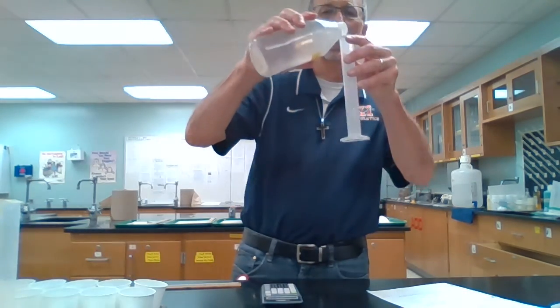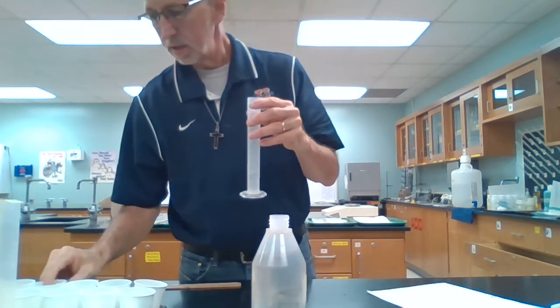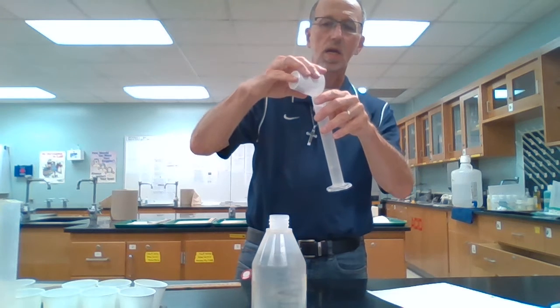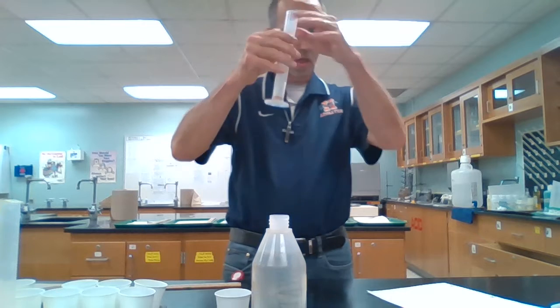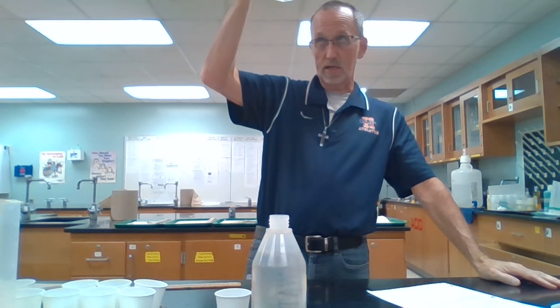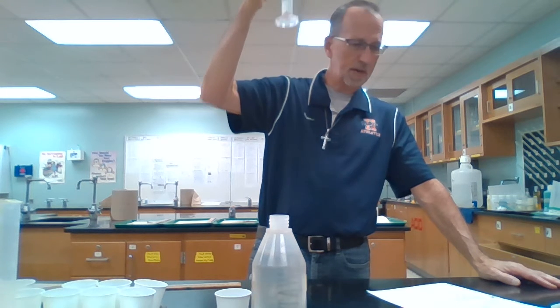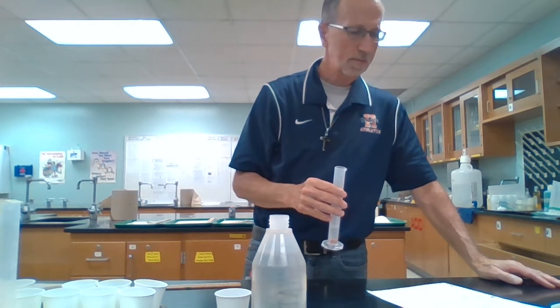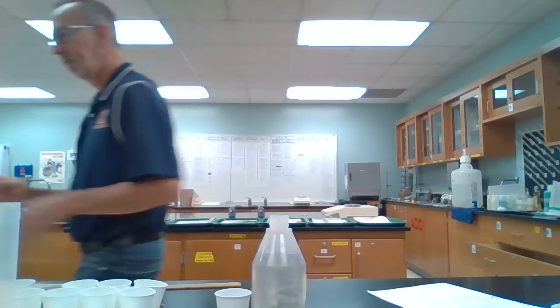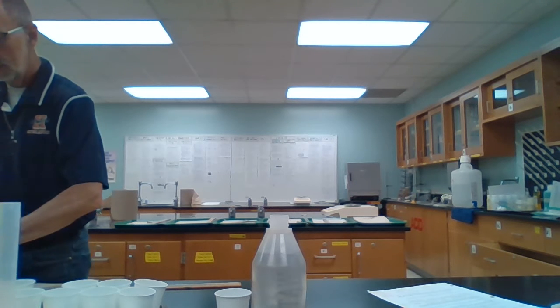Number 4 is little pieces again. So I need some. There we go. We'll put those in there. And let's see. Well, that didn't go up much. Looks like it went up by about 1.0 mL, as close as I can tell. About 1.0 mL for number 4. Again, we're on copper.